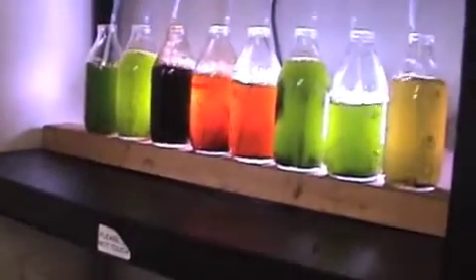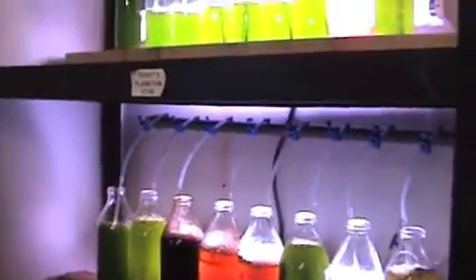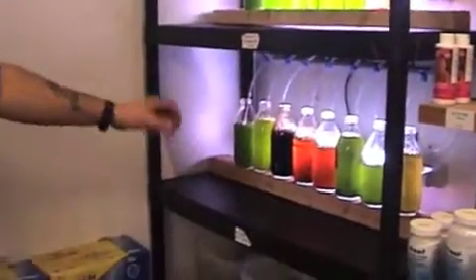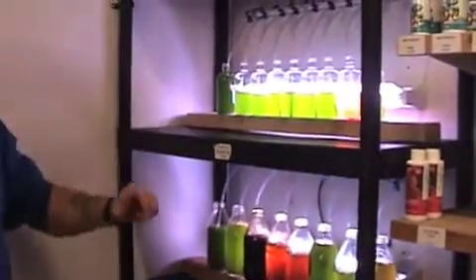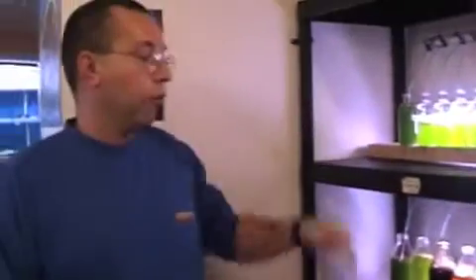Then we increase the water by about 20 or 30 per cent every couple of days. After we've increased it up to the first 250ml bottle size, we would then put it into the next larger size and carry on the process by increasing the water and increasing the fertiliser a little bit more. Then we'll carry on growing until we've got up to the one litre bottle size, then we'll use it and bottle it.